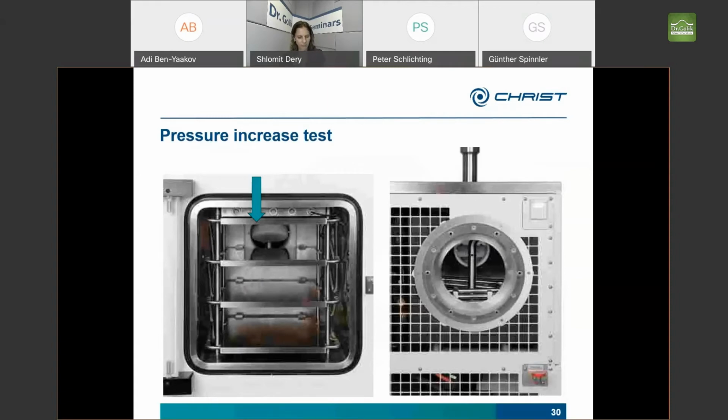So within a laboratory freeze dryer, in this kind of pilot freeze dryer, that is possible. How many sensors can I install wired, and how many wireless? Wired depends on the connections. You will see here the connection ports. You can add up to, I think it was 8. That was the maximum that you can position here. If you need more, you need more connection ports. And for the wireless, we have at the moment for the Epsilon pilot freeze dryers 8 and 16. That's the maximum. Okay, thank you. You're welcome.